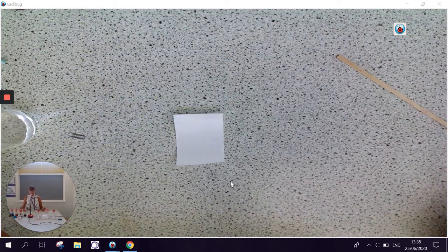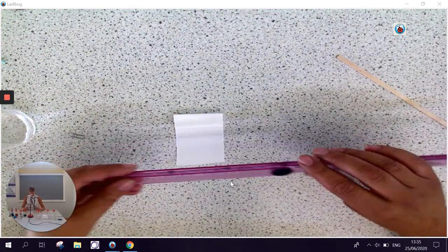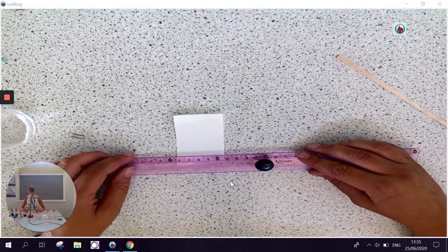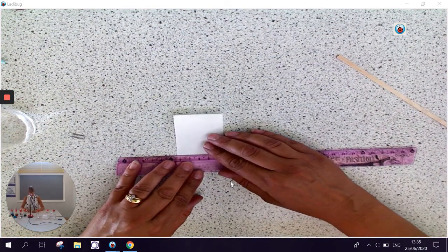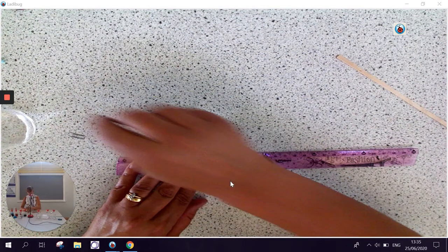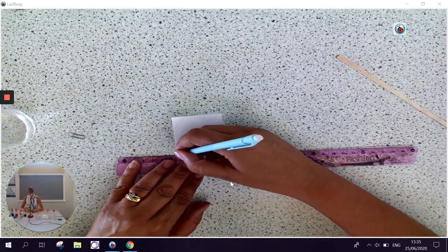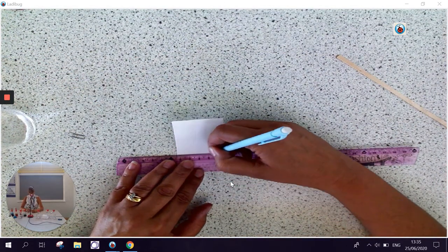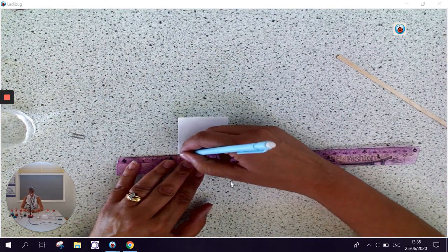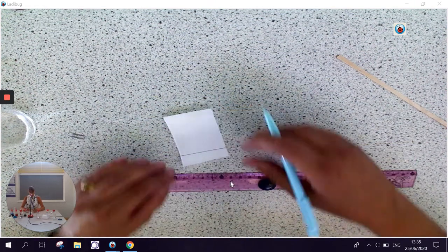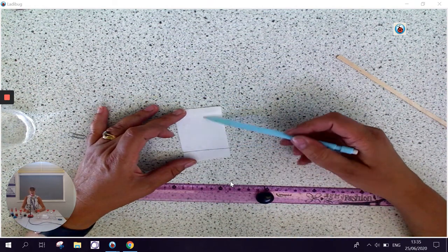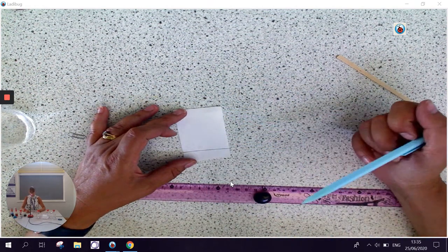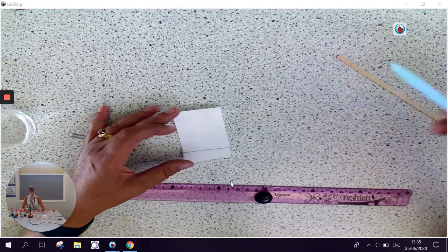So first of all, we need to draw a line on our chromatography paper. And we do this with pencil. It's a frequently asked exam question. We must use pencil. If we used ink, then the ink would run up the paper as well. So we must use pencil.